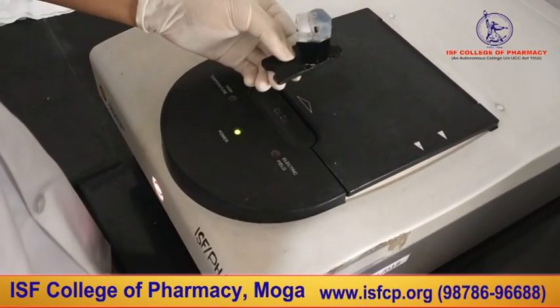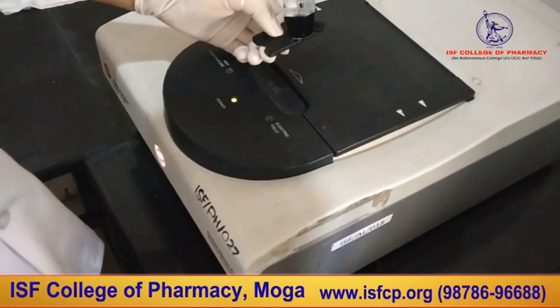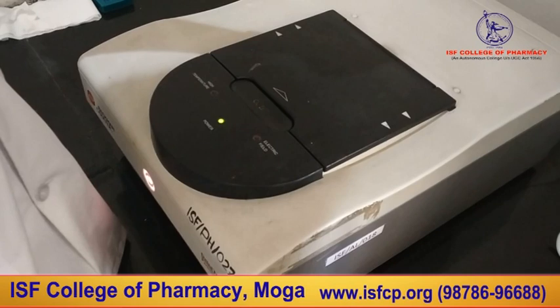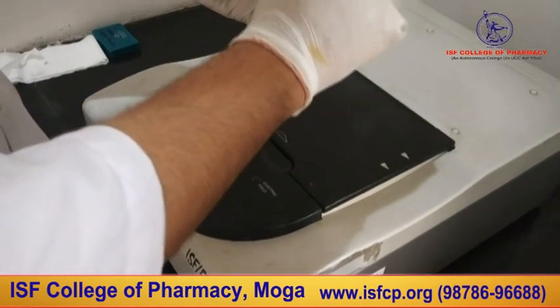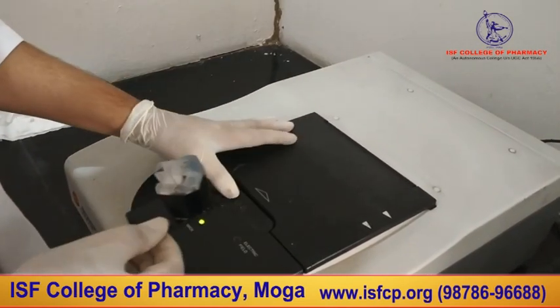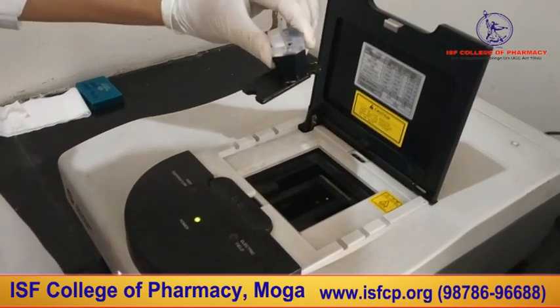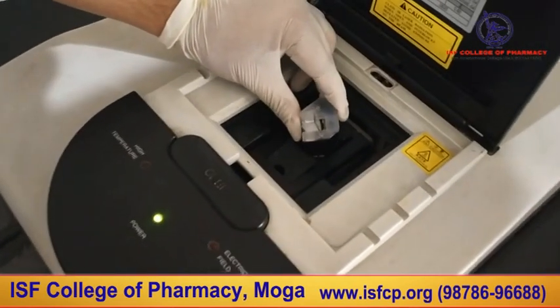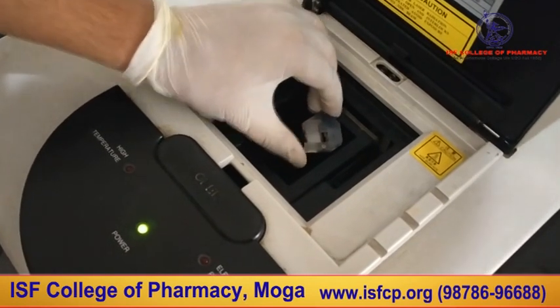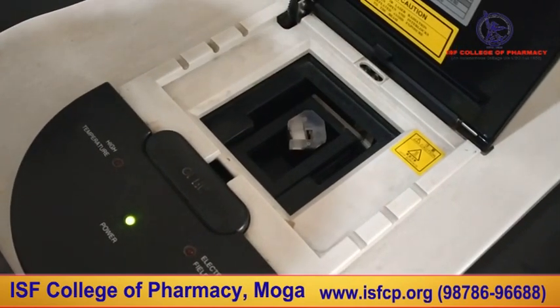Friends, we are going to measure the particle size by utilizing Delsa Nano C, and this is the specific socket for measuring the particle size. Let's see how we are going to place the socket inside. Just open it. This is very delicate, so we have to keep it very smoothly. Make sure everything has been placed properly. Now close the door.